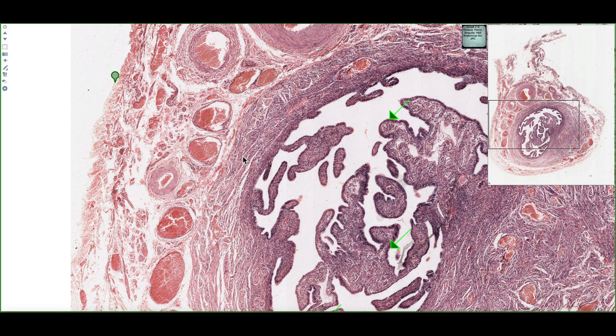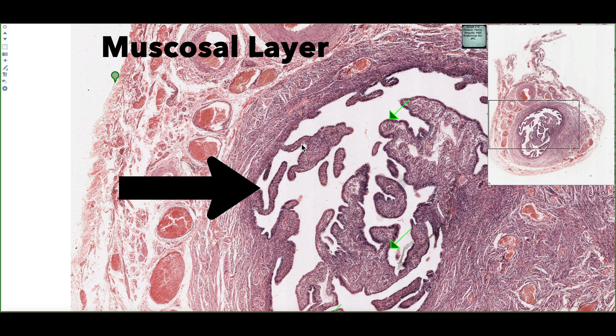Deep to the muscularis layer, we see the mucosal layer, which is characterized by all these mucosal folds that are extending into the lumen of the oviduct.